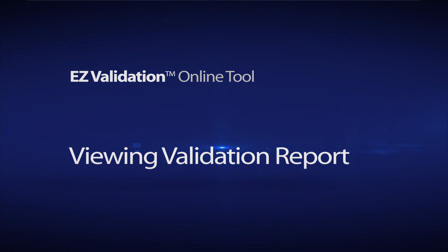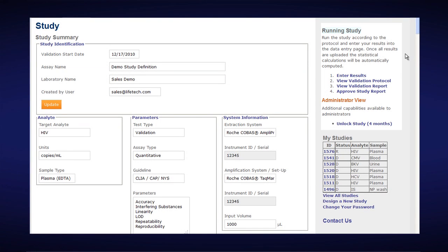Viewing your validation report in the Easy Validation Online Tool. The two outputs for your validation are two documents: the first being the validation protocol, which is what you plan to do, and the second being the validation report, which is what you did, what the results were, and whether you passed or failed your acceptance criteria.